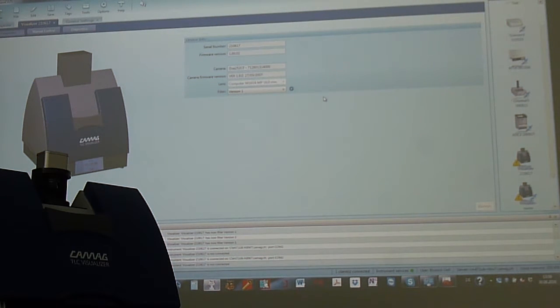Yeah, this is the manual, the properties. This is telling something like maybe it's okay. This thing for selecting the filter is for documentation only, or why?